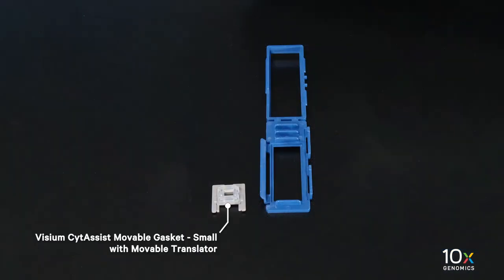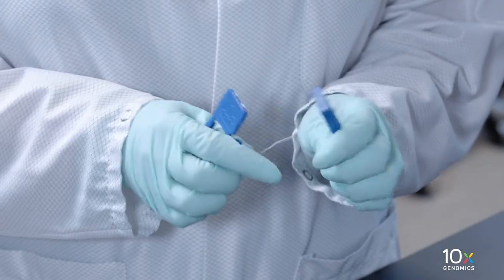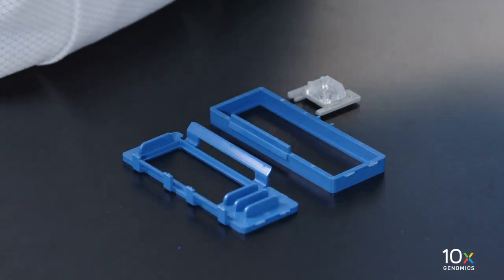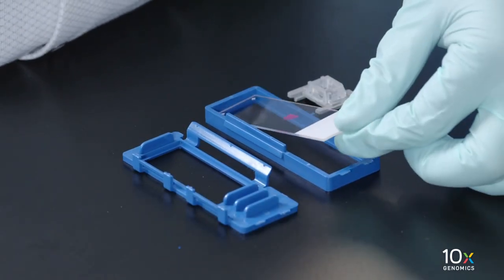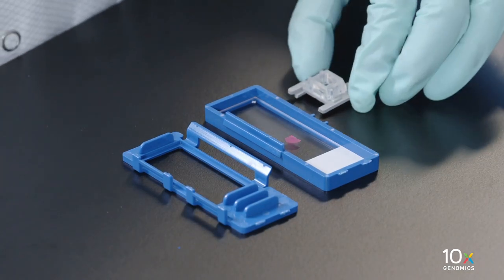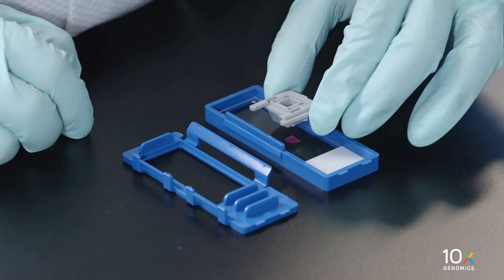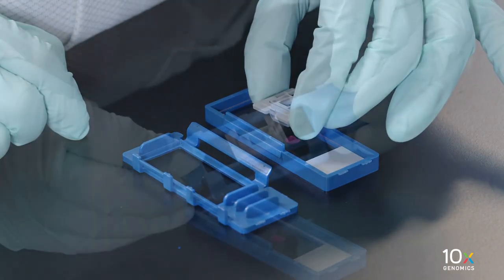We have the Visium CytAssist Movable Gasket Small, Visium CytAssist Movable Translator, and Visium CytAssist Movable Cassette Frame. Pull apart the hinges of the upper and lower halves of the cassette. Place the Tissue Slide in the lower half of the cassette. Determine the gasket orientation to center the tissue. The 6.5 millimeter gasket can be adjusted horizontally and rotated in two directions.